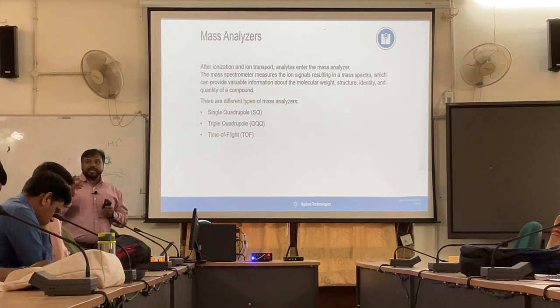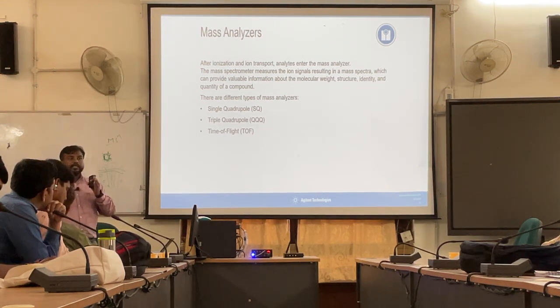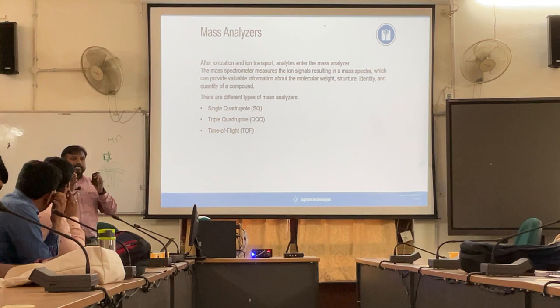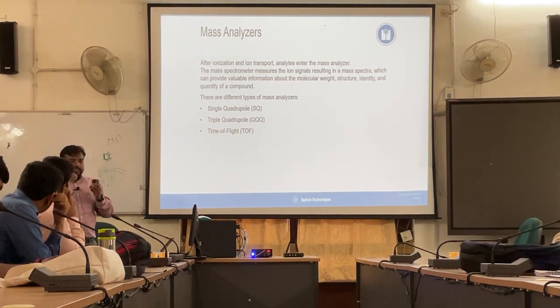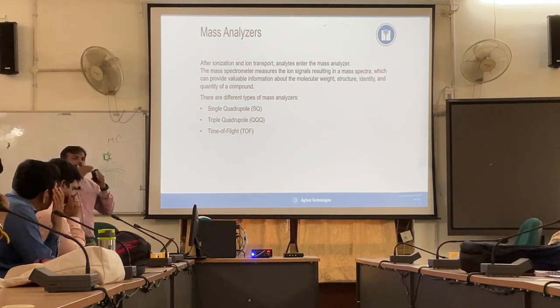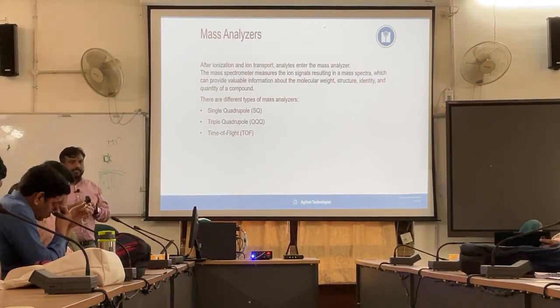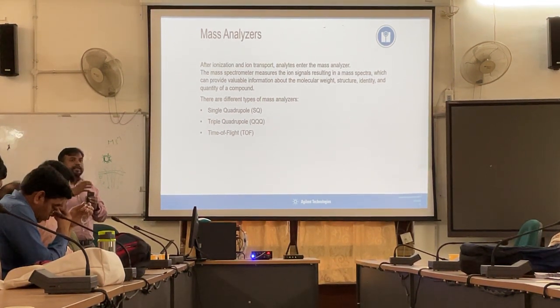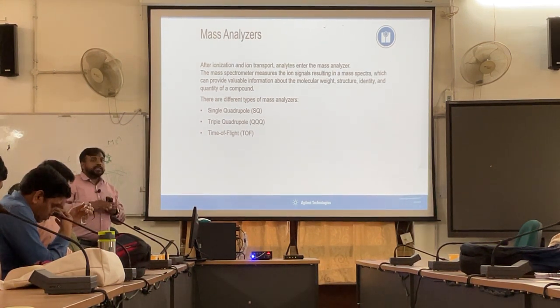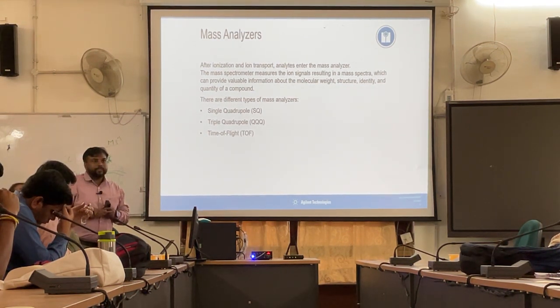In the collision cell we are applying a potential difference with nitrogen gas. What this collision energy does is, with that potential difference, the nitrogen gas movement would be fast or slow depending on how much collision energy you are applying. So once any ion which has passed through the first quadrupole goes to collide with that nitrogen gas, it breaks down into product masses. And further, the quadrupole will filter only the selected product masses. That's the reason the sensitivity in the quadrupole is far better, and that's the reason we always recommend the quadrupole for quantitation analysis.